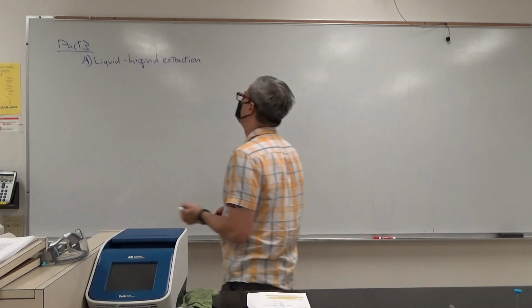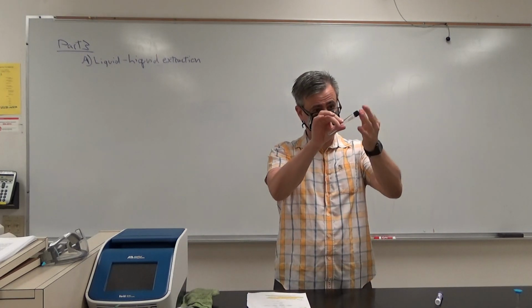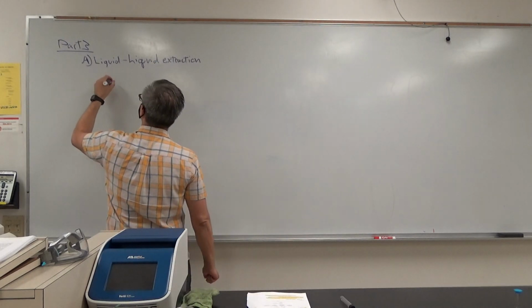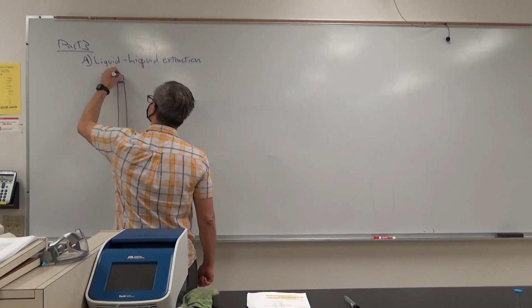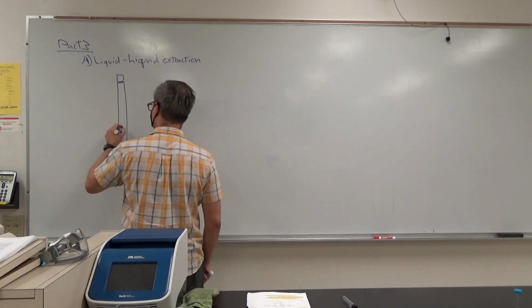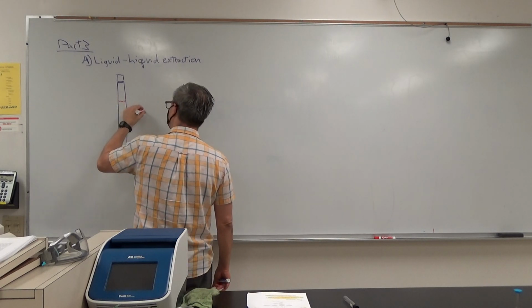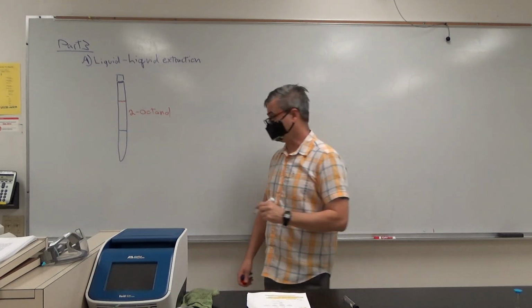Okay. So we're going to do this physically in a culture tube. This is a culture tube. It's the one that's got threads on the top. Okay. And so you're going to take a culture tube, and you're going to have 3 mL of your solution A, and you're going to have 3 mL of 2-octanol. Okay? The octanol is the organic layer.